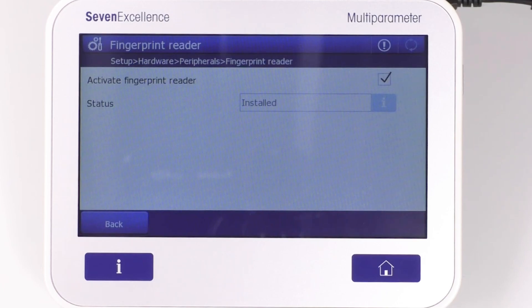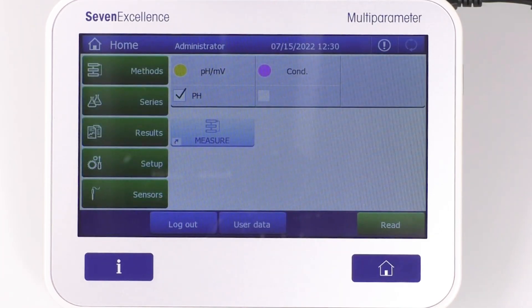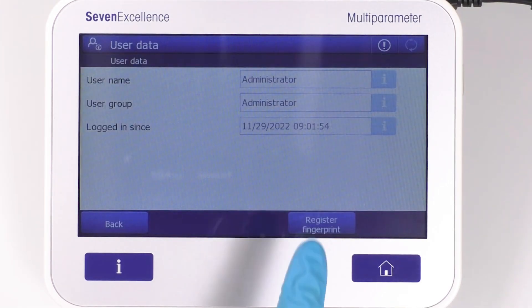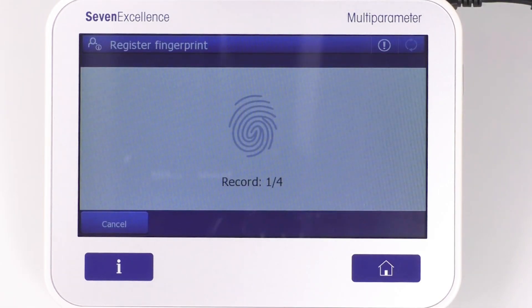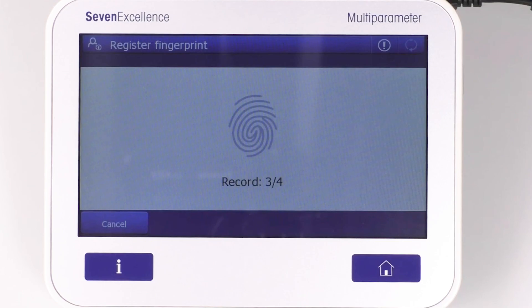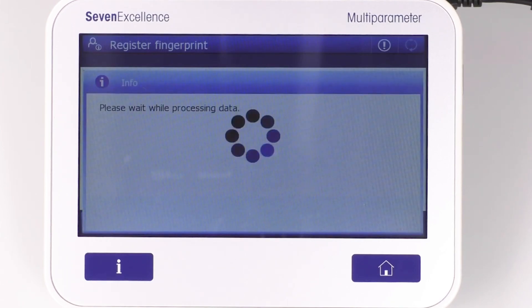Here you will see that the meter shows the installed status. To register your fingerprint, simply go back to the main screen, click on User Data, and register your fingerprint. You will be prompted to register your fingerprint four times.